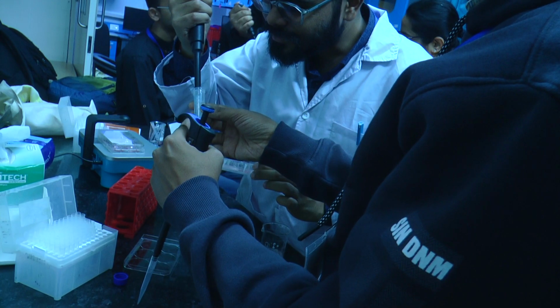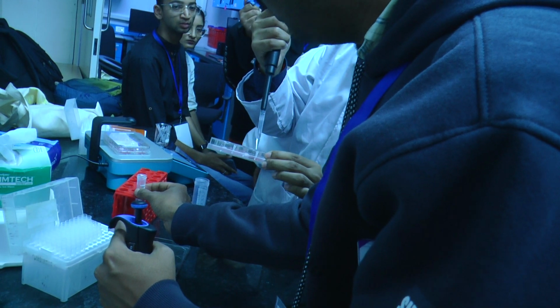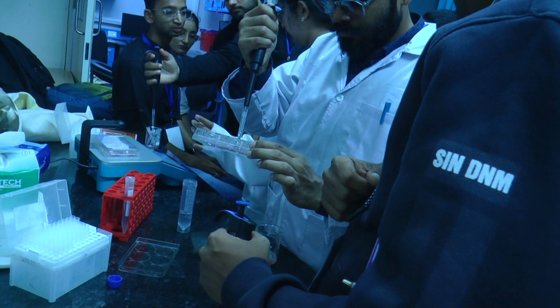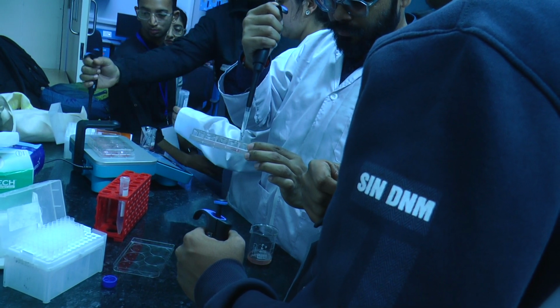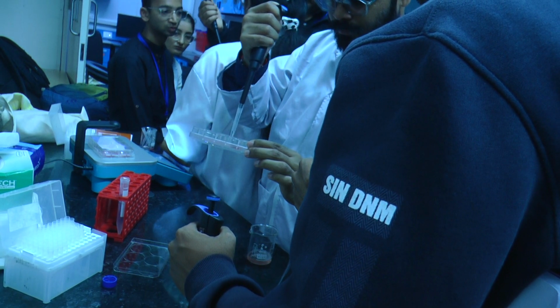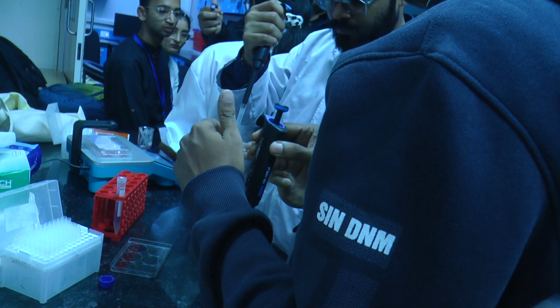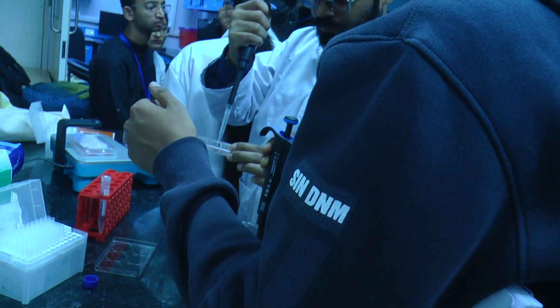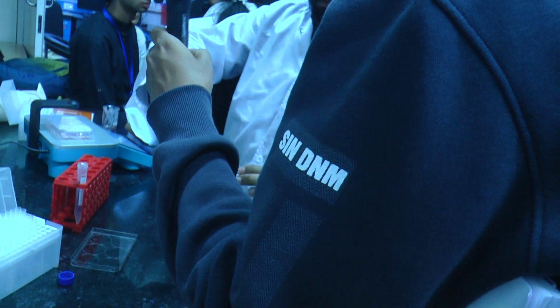Just put one. Okay. So distribute it slowly. When pipetting also you can insulate. Done. And now take the other. This is the buffer which we are using for the washing. The first vesiculation buffer. We will take 1 ml. We can use that once again, just keep the tip like that around. We are using the same solution, right? Just keep it around.